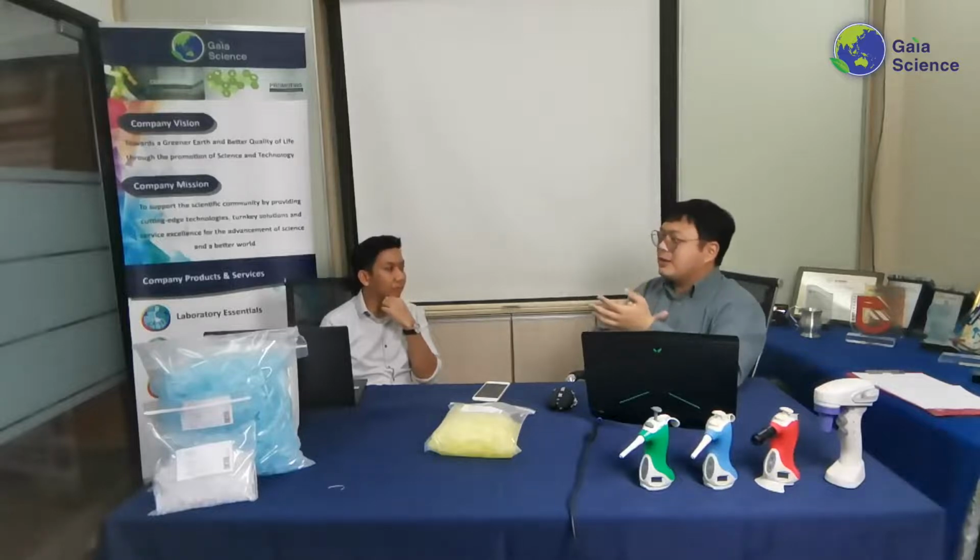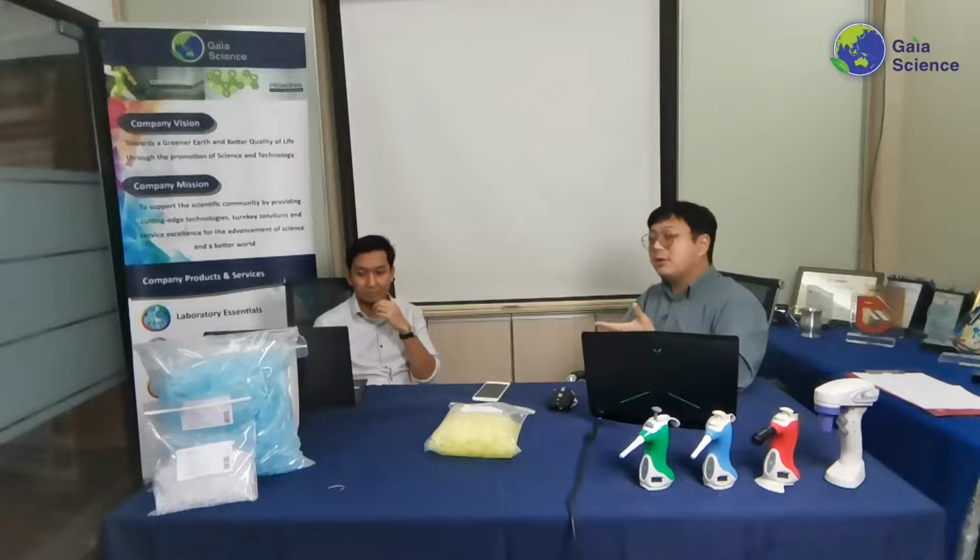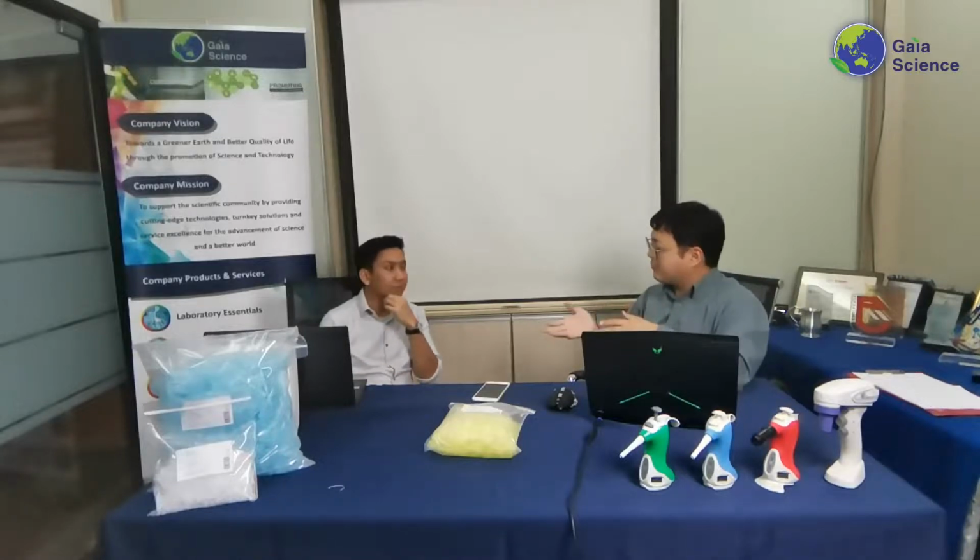But if that is not your concern, then wide bore or wide orifice tips shouldn't be considered, because they're also a little bit pricier, as they're manufactured slightly differently with different molds. So it's really a case-by-case basis of what you're looking to do. I will just add that it will prevent some shearing and it reduces flow resistance. Yeah, I think those are the main points for wide orifice, wide bore.